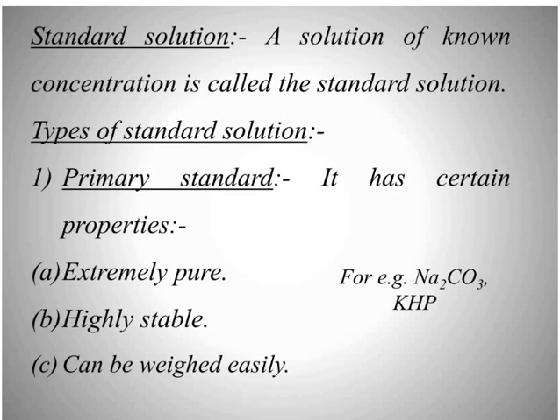Now standard solution. You know my friends, what is the meaning of a standard solution? A solution of known concentration. Here the important term, known concentration, is called the standard solution.